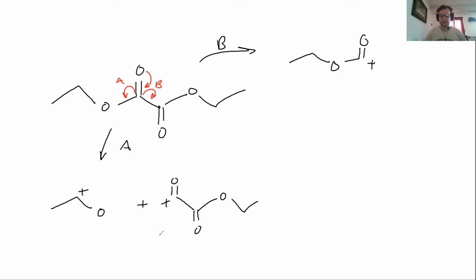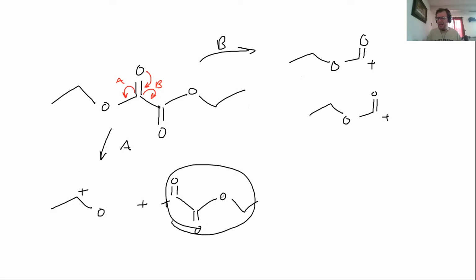Now you can kind of tell which one is more likely to form. So if we have two of these, you can kind of look at them and intuitively see that these guys are probably going to be more stable. Why is that? Because this guy is really not stable. These two oxygens right here, or three oxygens, all want their electrons. And as soon as that happens, another electron is going to come in and split this guy even more.